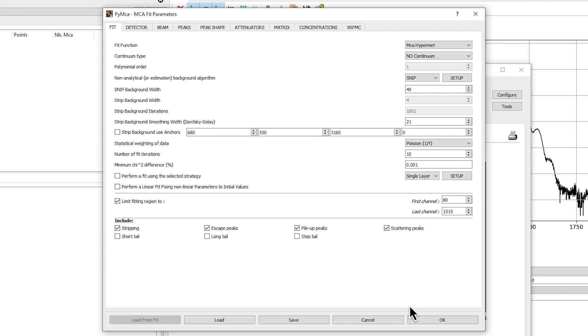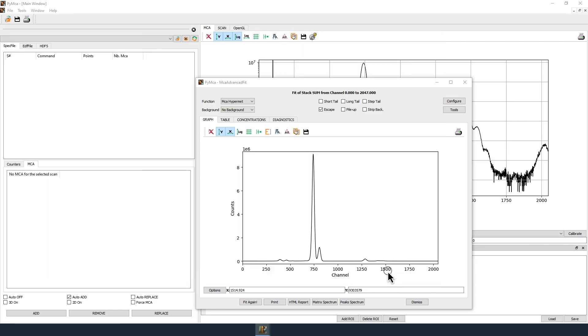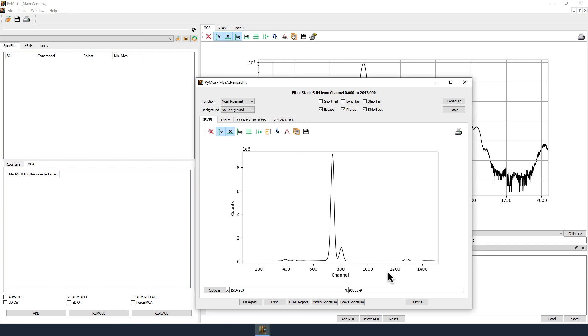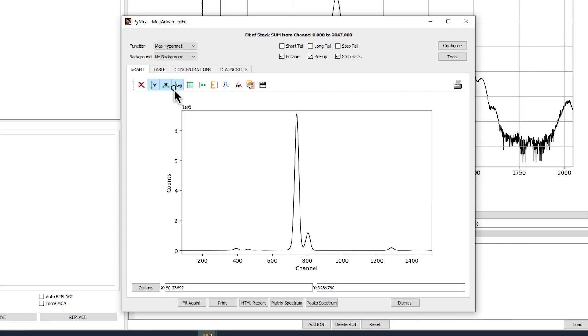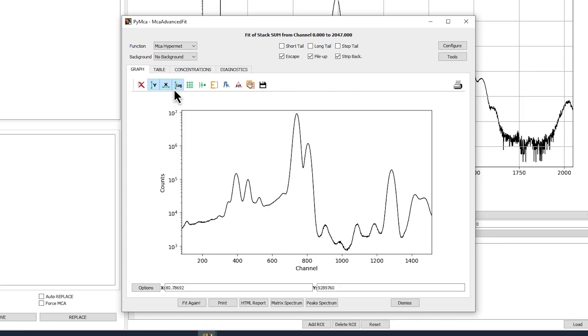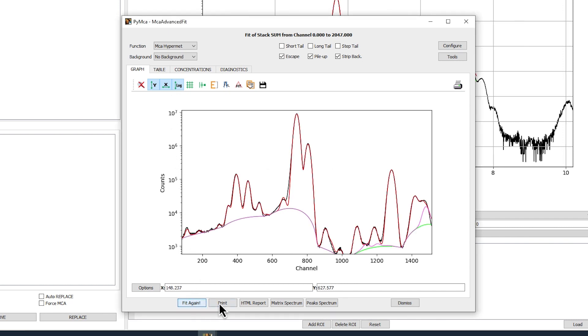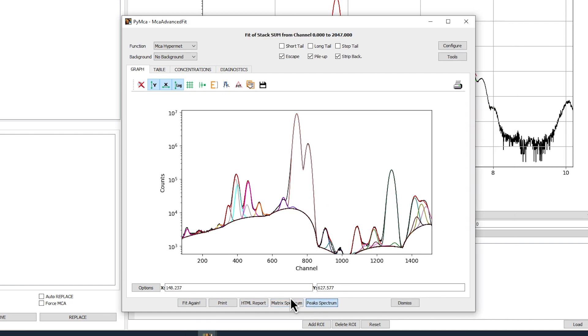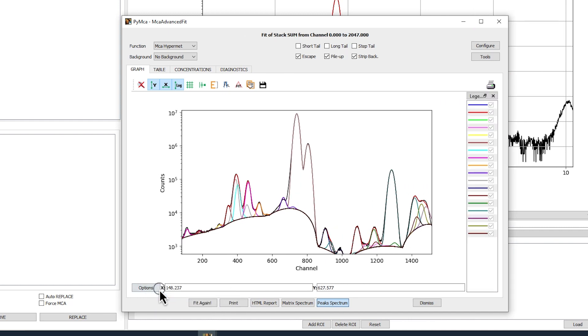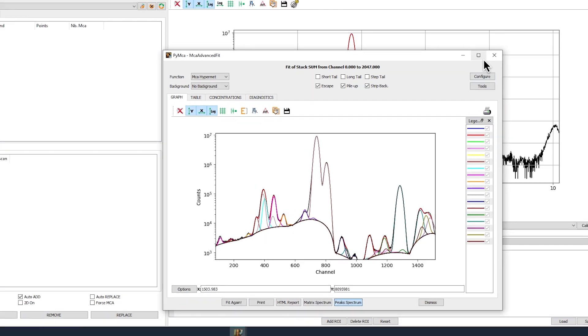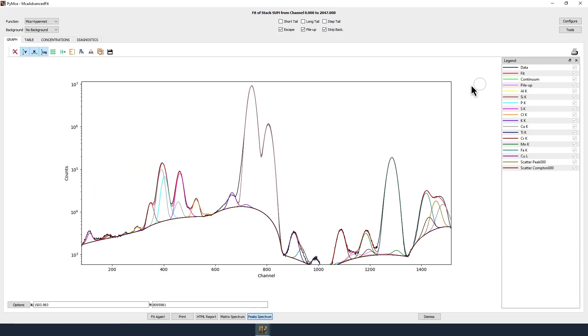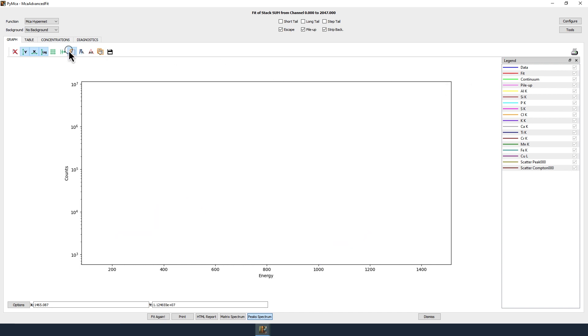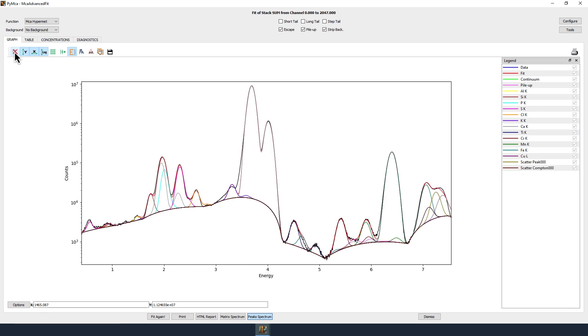To do a fit, click on OK. In the MCA advanced fit window, you can display the XRF spectrum in logarithmic scale by clicking on the toggle logarithmic y-axis icon. Click on Fit Again. Click on Peaks Spectrum to display the peaks, and on Options, then Show, then Hide Legends to display the legend. You can display the x-axis in energy instead of channel by clicking on the E icon and then on Auto Scale the Graph icon.